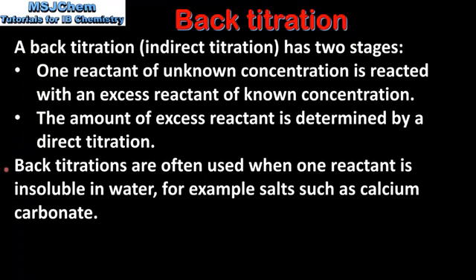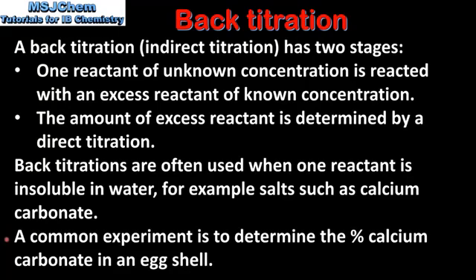Back titrations are often used when one reactant is insoluble in water, for example, salts such as calcium carbonate. A common experiment using a back titration is to determine the percentage calcium carbonate in an eggshell. So next we look at an example of how to do this.